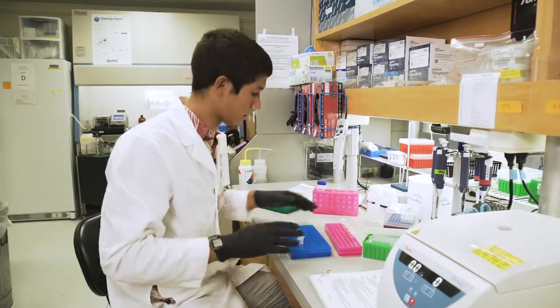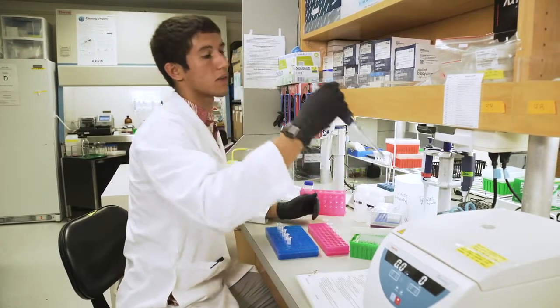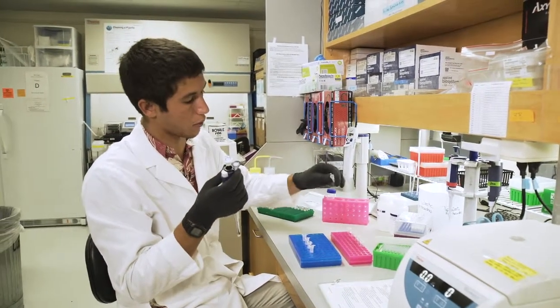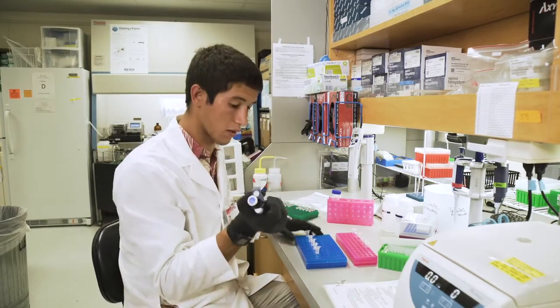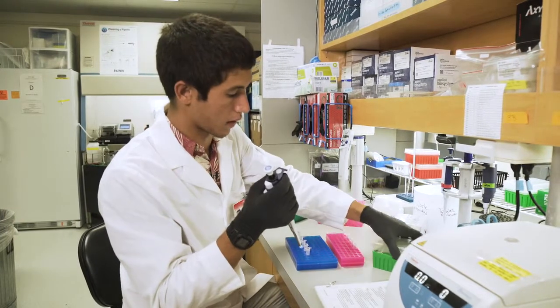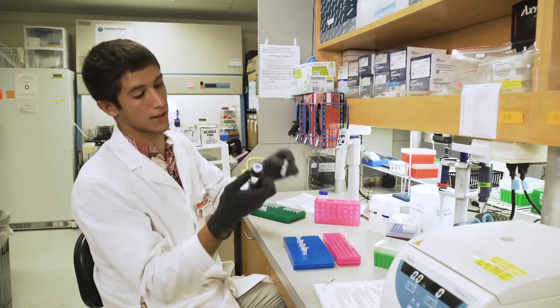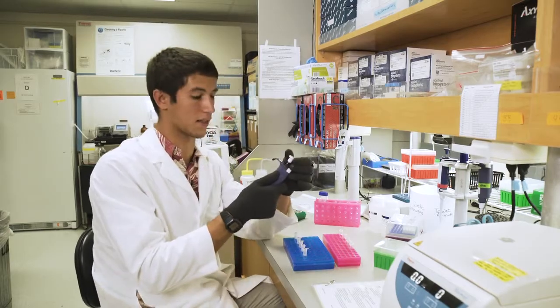Then we get to go ahead and centrifuge them, which is the fun part. So for this, we're just pulling the whole volume out of the original tube and putting it into the correctly labeled collection and filter tube. The filter columns can hold up to 600 microliters, so we're going to set this to 600, and this should pull out just about everything that's in the tube.